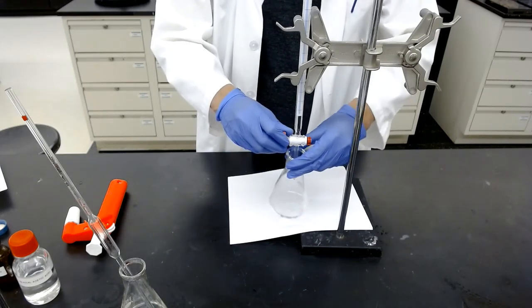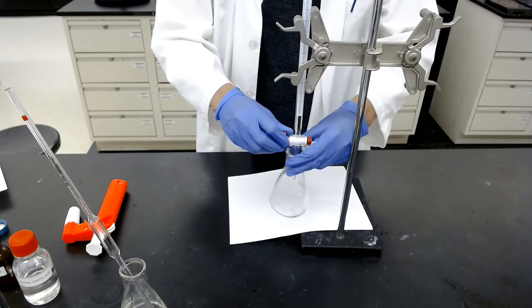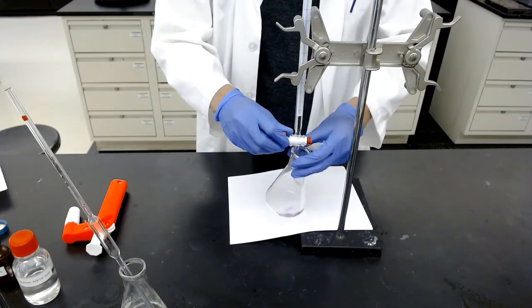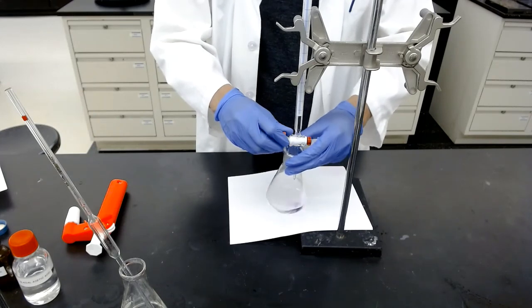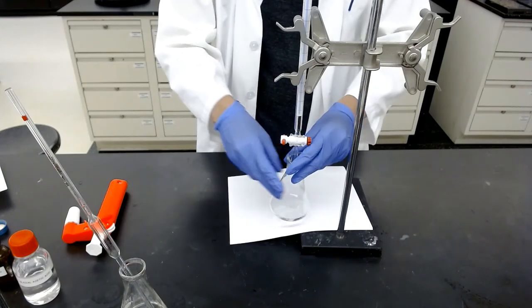So at the beginning, you can drain this base solution a little bit fast, but I think around when it reaches about 10 ml, you're going to have to slow down, right? Because you don't want to overshoot it. All right, maybe slow down a little bit. Okay, I think we're almost there.